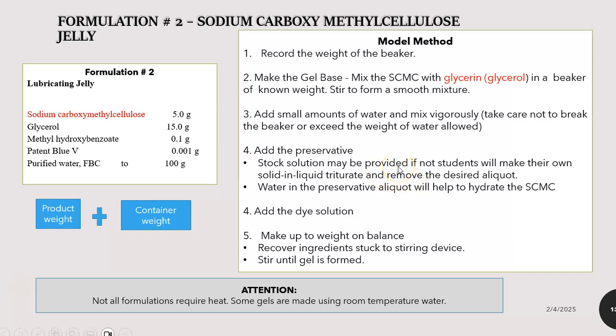And of course, whichever beaker you make your solution in, you should be rinsing it to recover all that you have dissolved. And this is what you'll also do if you are adding a soluble drug. You look at the solubility. Does it need hot water, room temperature water? You dissolve the drug, just like the methyl hydroxybenzoate here.